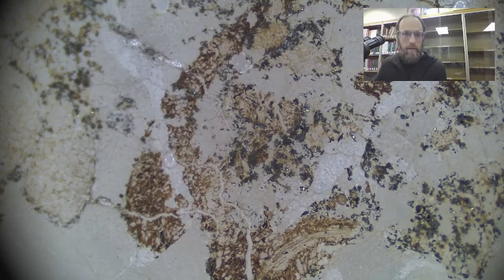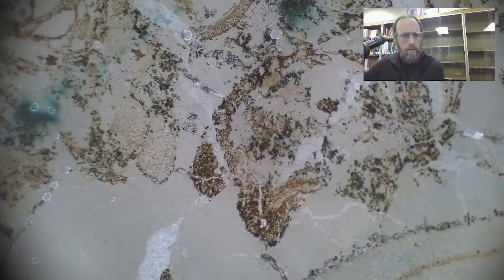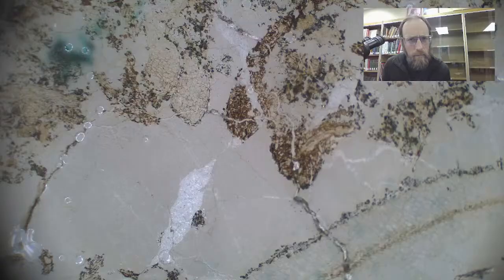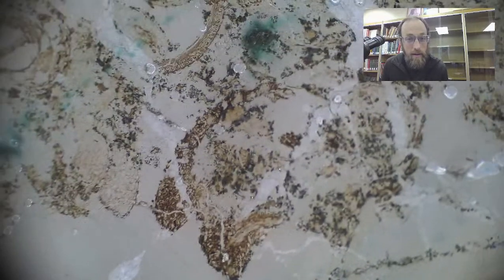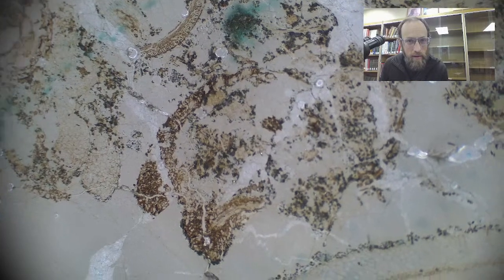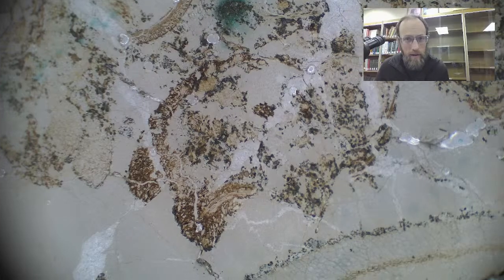One thing we look for is comminuted debris. Rather than accuse any one of these objects characterized by comminuted debris as itself being a coprolite, I want to take the whole scene into consideration.